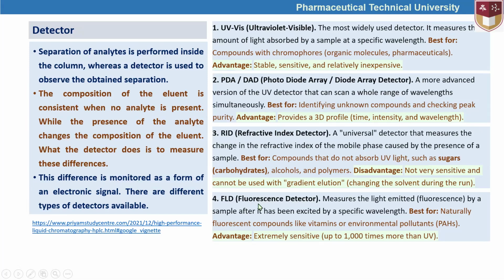And the next type is fluorescence detectors. We have a separate video lesson about fluorescence.